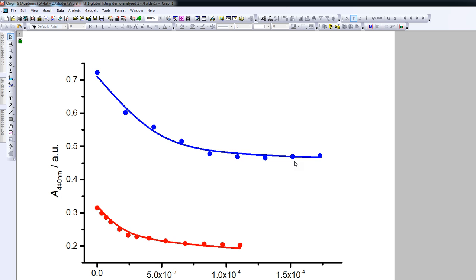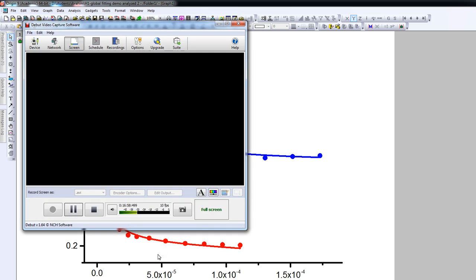So that's the way to do a global data fit and to prepare the graph so that it looks good in a PowerPoint presentation. Good luck.